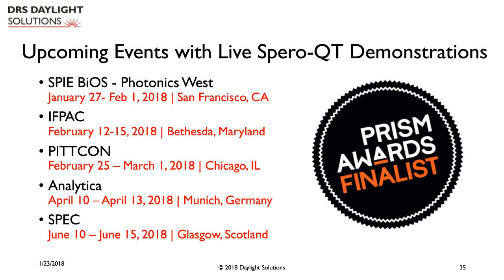Here's another question for Nick. For features smaller than the diffraction limit, are those features still shown? So features that are below the diffraction limit are still visible. We're just not able to resolve them from each other. And while we can't resolve them particularly, we can still interrogate them for their chemical spectral data.